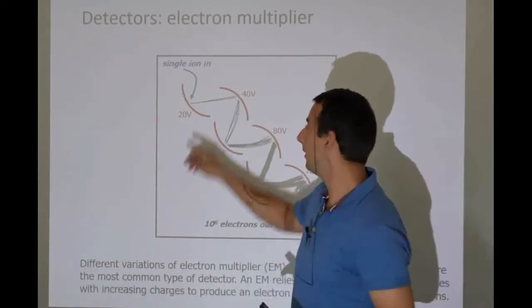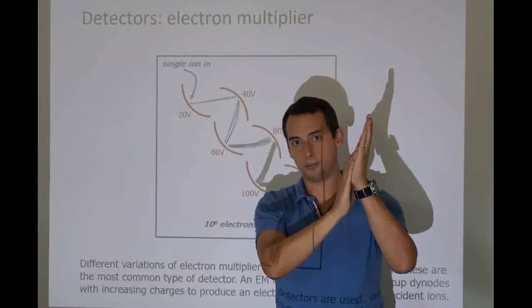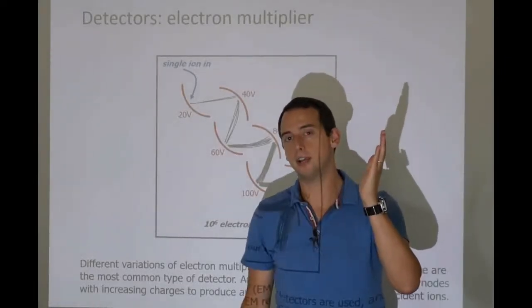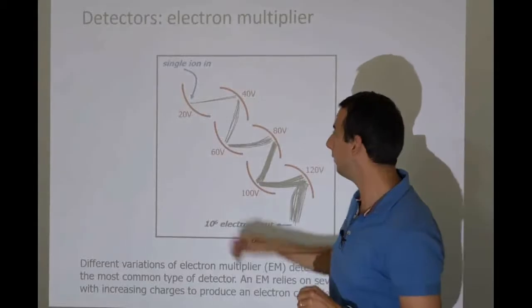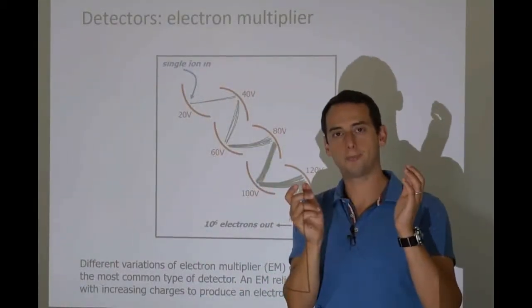Because the analyte is going to literally bump into this dynode. It's going to make quite a bit of a smash when it hits the surface of the dynode. In fact, there is sufficient energy, and this has to do with the tweaking of this voltage, that it's in the right range, to knock free a few electrons.